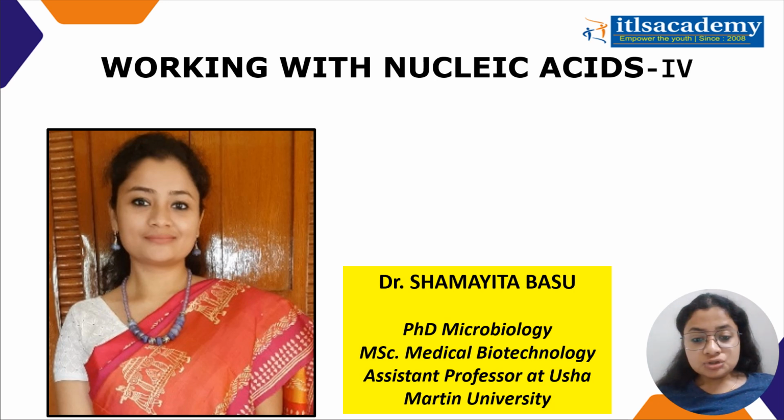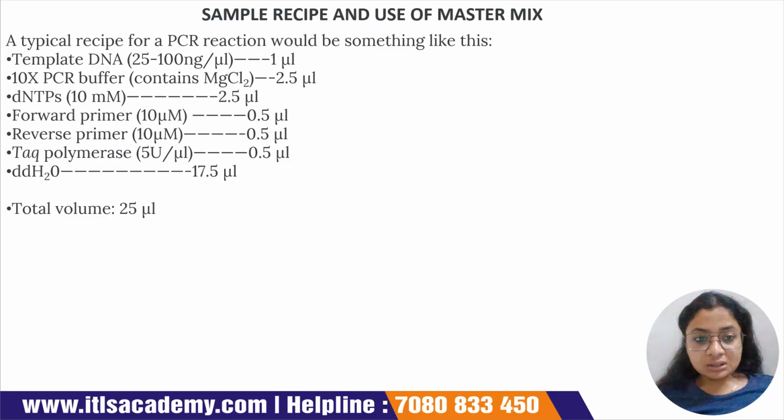In the last topic I had started with setting up of PCR reaction, where I had discussed how much template we should take. Now the next step of setting up of PCR reaction will be covered.